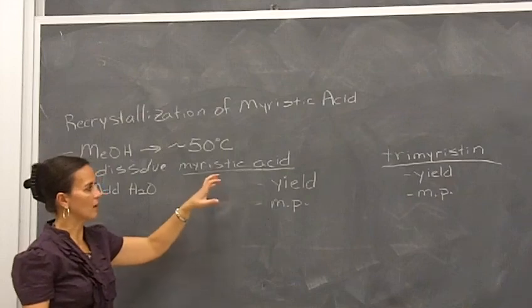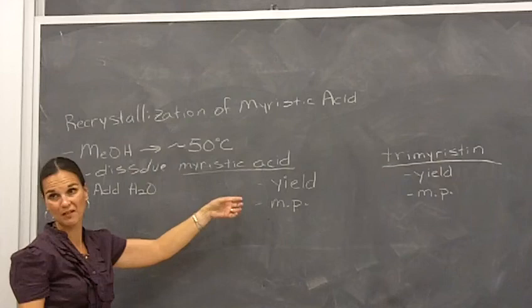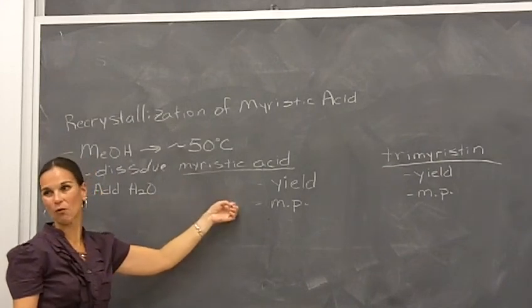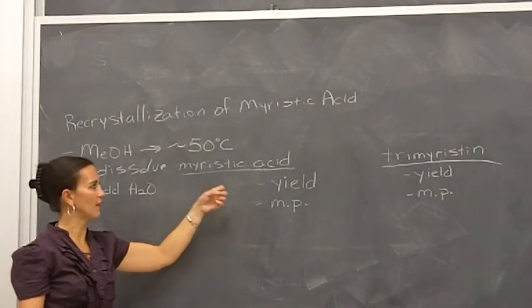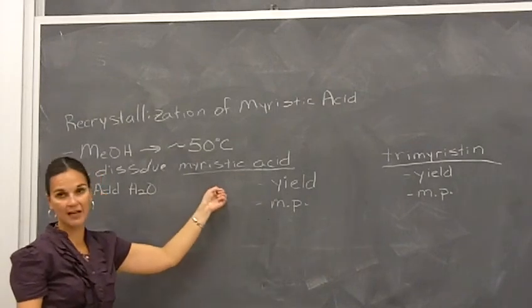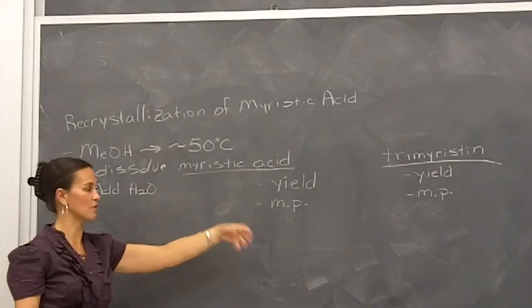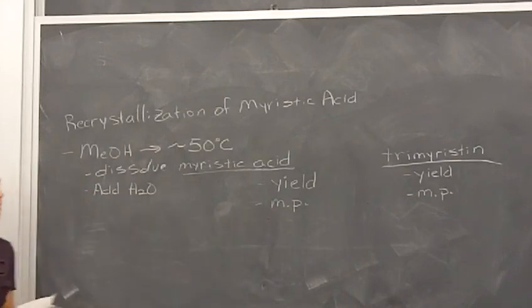But I talked about these two also having very similar melting points, okay? So just getting the melting point itself is not going to be good enough. We'll need some other way to confirm that your trimyristin and your myristic acid are two different solids so that you aren't getting out of your hydrolysis reaction just more trimyristin, all right? Thinking about experiment 1, what would be a way to prove that those two solids are different?